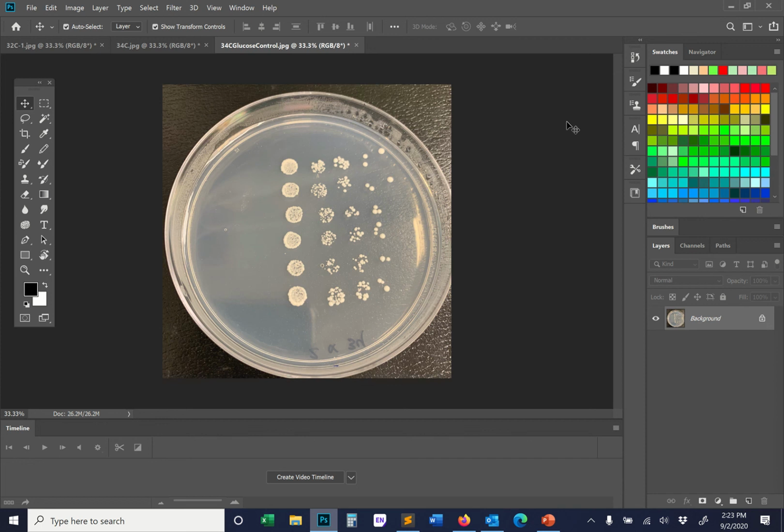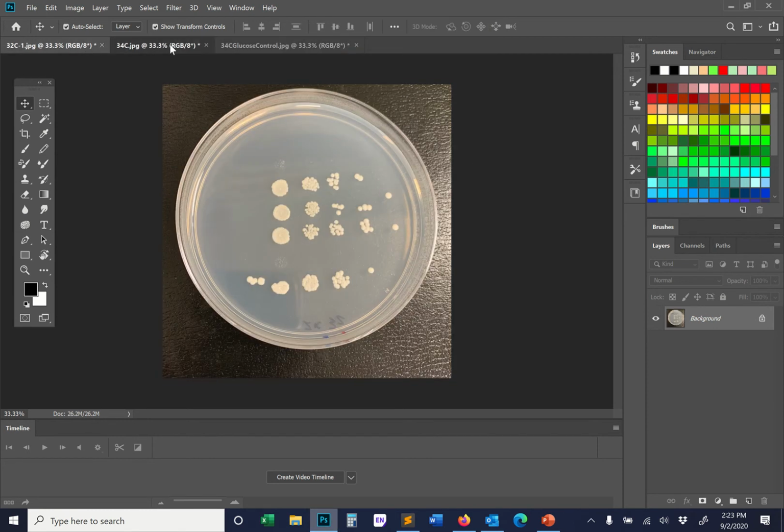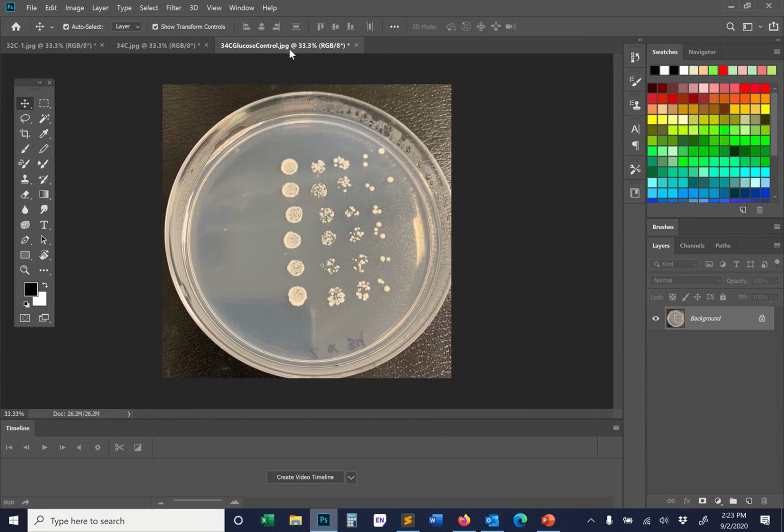Let's talk about some analysis of some microbiology data. Very commonly when you're working with yeast or microbes, often you collect data on what would be agar or LB or microbiology plates. And oftentimes you want to capture that data and present that data in a nice figure. So here I've got 3 images of data from an experiment in yeast.